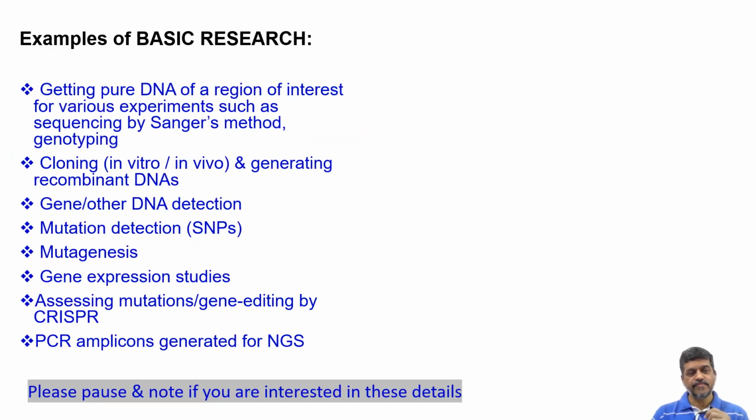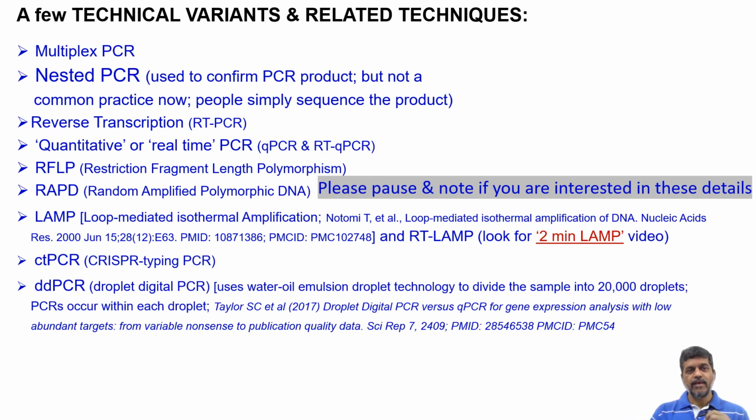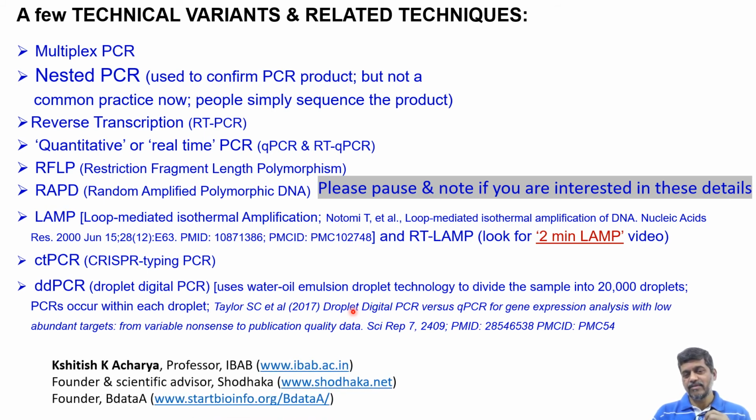But quickly to move on, I am also listing examples of basic research, including some of the latest ones such as CRISPR results, like what are the mutations, if you want to test, we can use PCR. PCR amplicons can be produced for next generation sequencing, etc. There are also a lot of different applications where PCR is used even today, and there are technical variants that we should be aware of, as well as related techniques, for example LAMP, CRISPR typing PCR, droplet digital PCR. These are some of the new things that have come up in recent years. Very useful, and the beginners definitely should note them.